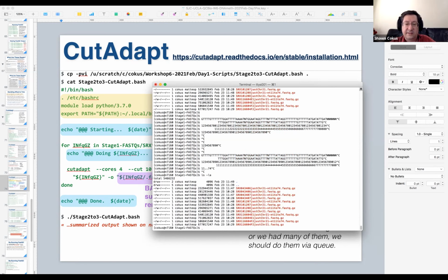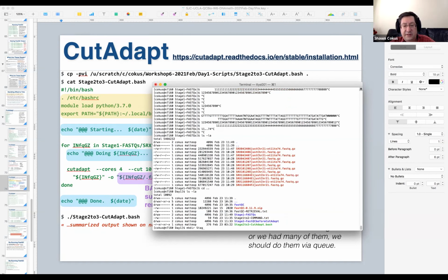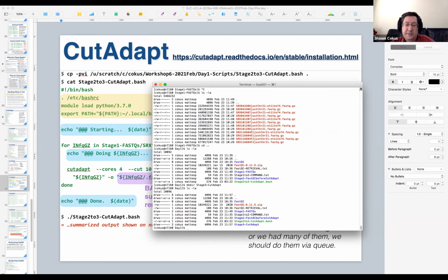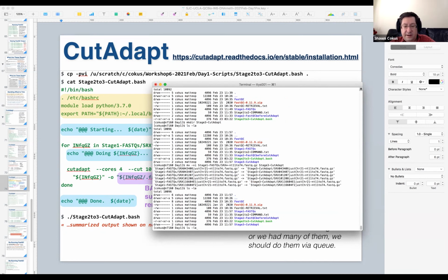It says things have gone right. So it looks like everything is good. We are happy. We have completed the stage. We will now make a stage 3 directory, which is our cutadapt output. I just made it. It's empty. We've got to move our files. They're not in stage 2. They're in stage 1. Okay. It is everything with NT 11 to 74 fastq.gz, and you've got to move it into the stage 3. There we go. Now I'm kind of cleaned up.